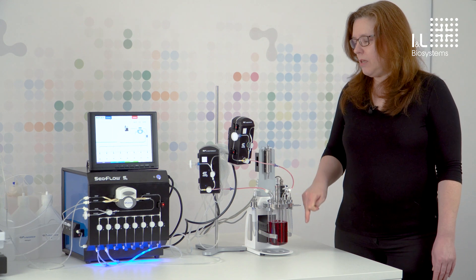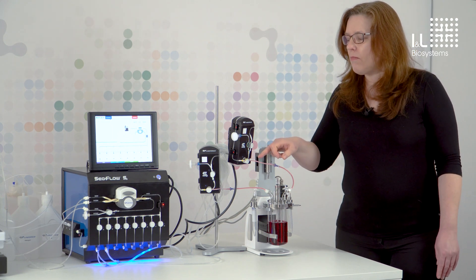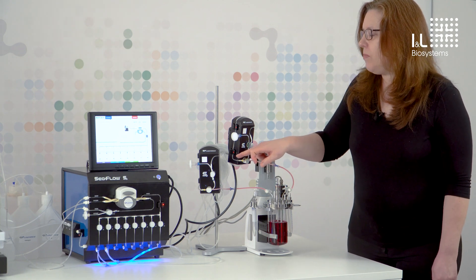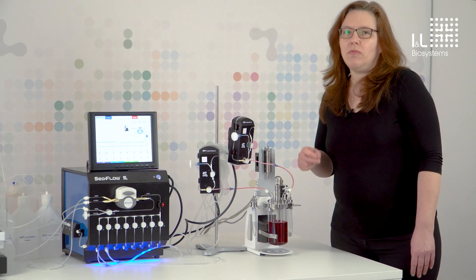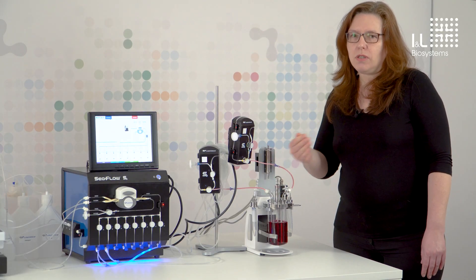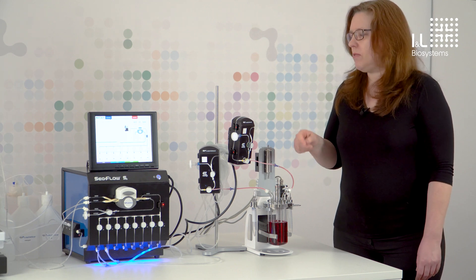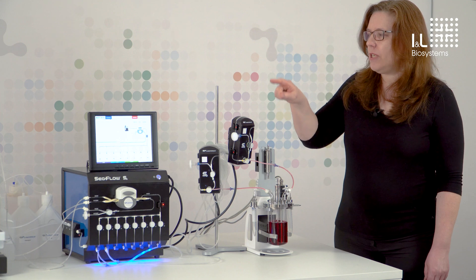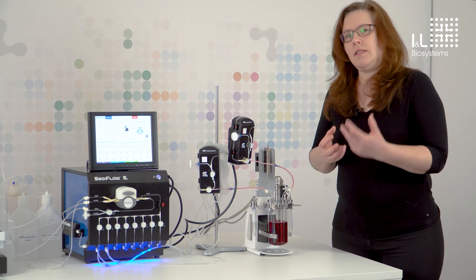This part is the dead volume in the whole sampling. The sample is led through two sensors here at the side which measure whether it contains liquid or air. The measurement is then carried out through the tube contactlessly by ultrasonic measurement. The sensors are installed at various locations in the system and help to optimize the flow.